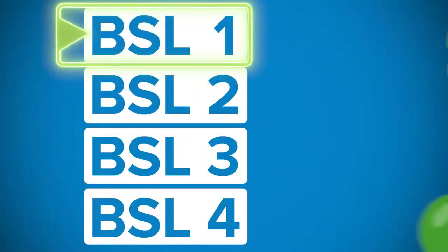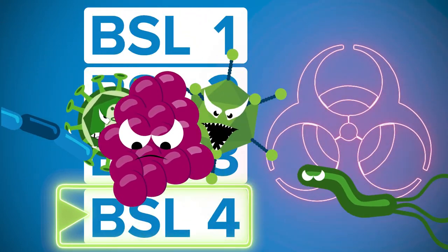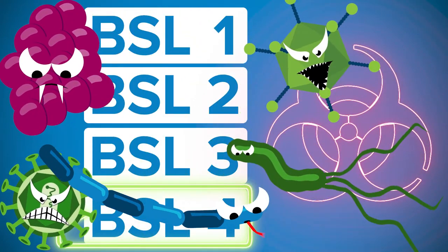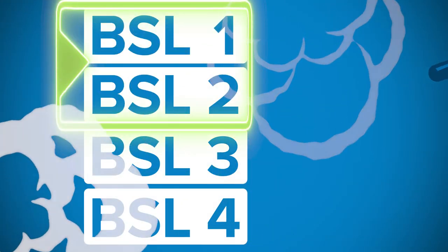BSL-2 includes all of the personal protective protocols that BSL-1 has, but with some additional precautions because the potential threats to humans and risks of infection and potential diseases increase as you go up from one through four. This protocol is directed towards BSL-1 and BSL-2 laboratories.